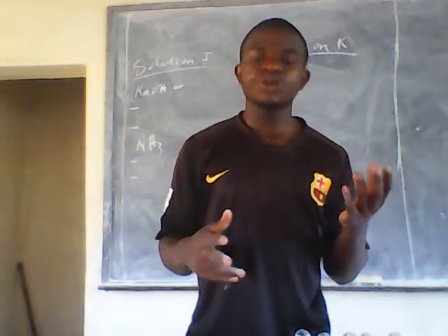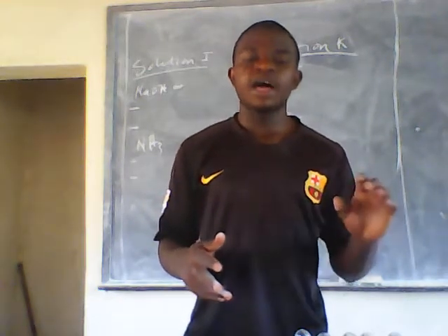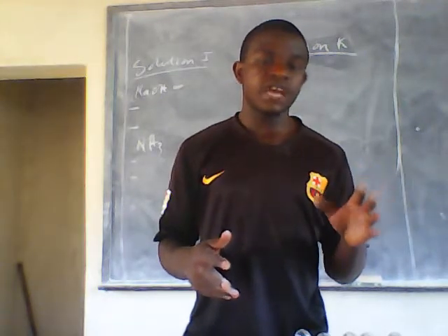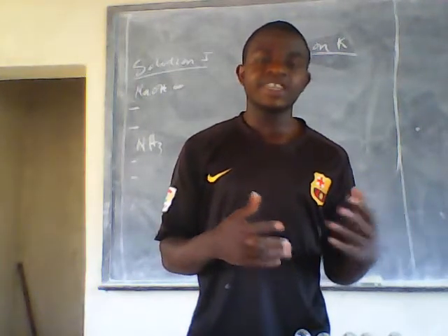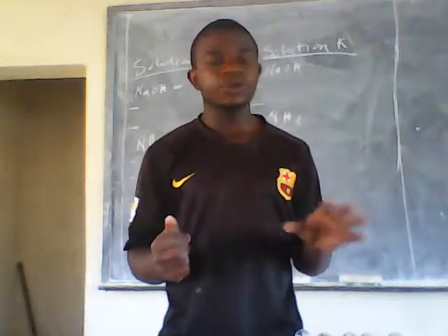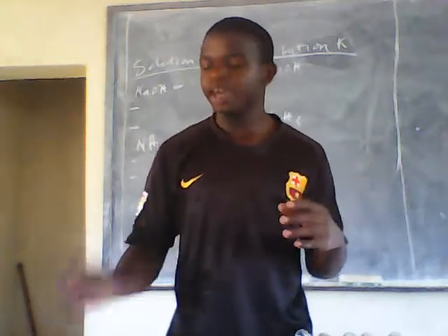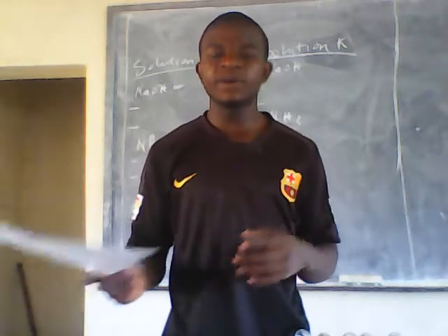Then you use those observations that you have found after doing the experiment to identify the cation present in that solution by using the qualitative analysis table. So I have the qualitative analysis table, and I'm going to give just one example.